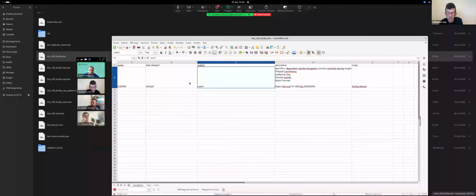There's one person that was on the Excel that's not anymore. It's the data manager, the person that is doing the import. The data manager is, for example, for the use case of electron microscopy facilities, where the author of the sample is not the one who is taking the data, and the one who is taking the data will push the data on behalf of the author.